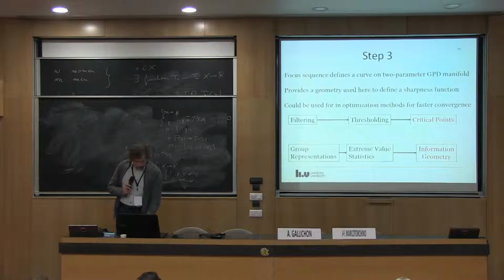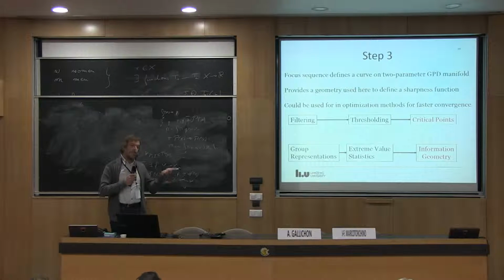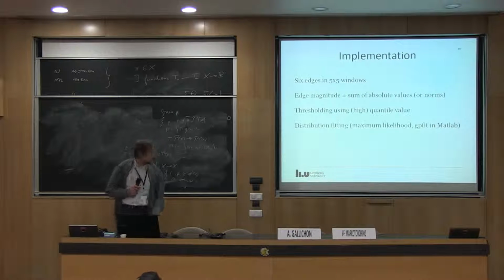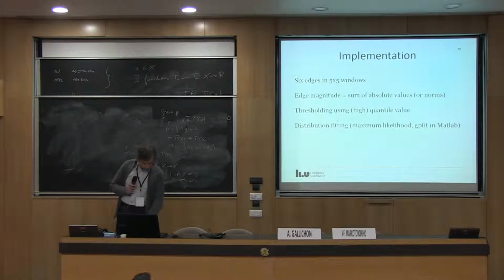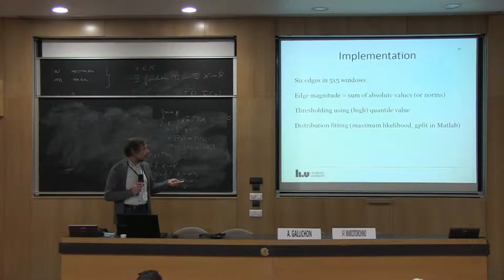And now, okay, nice theory and nice general results, but does it work? I mean, if it doesn't fit, then you have a problem. So I implemented this, and for the estimation of the Pareto parameters, I used the maximum likelihood estimator routine that is in MATLAB.